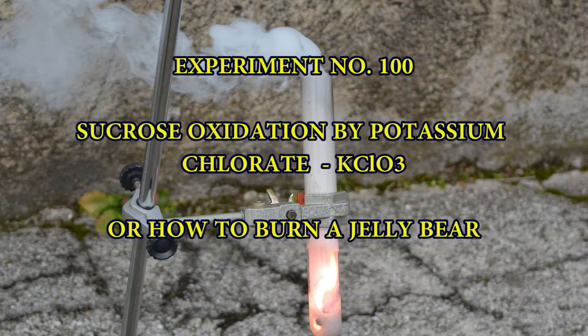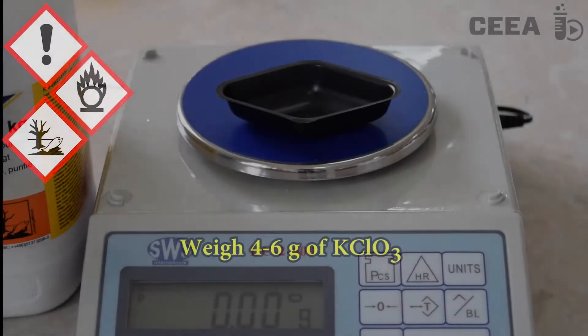Experiment No. 100: Sucrose Oxidation with Potassium Chlorate, or how to burn a jelly bear. Potassium chlorate is a very powerful oxidizing agent. Its properties will be studied in reaction with saccharose.